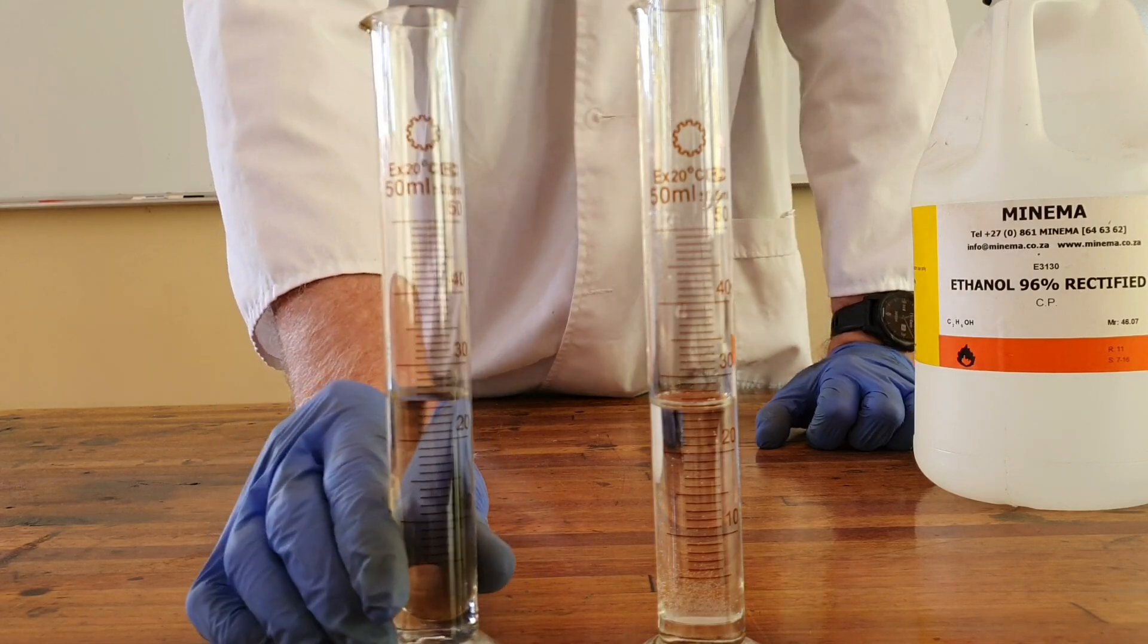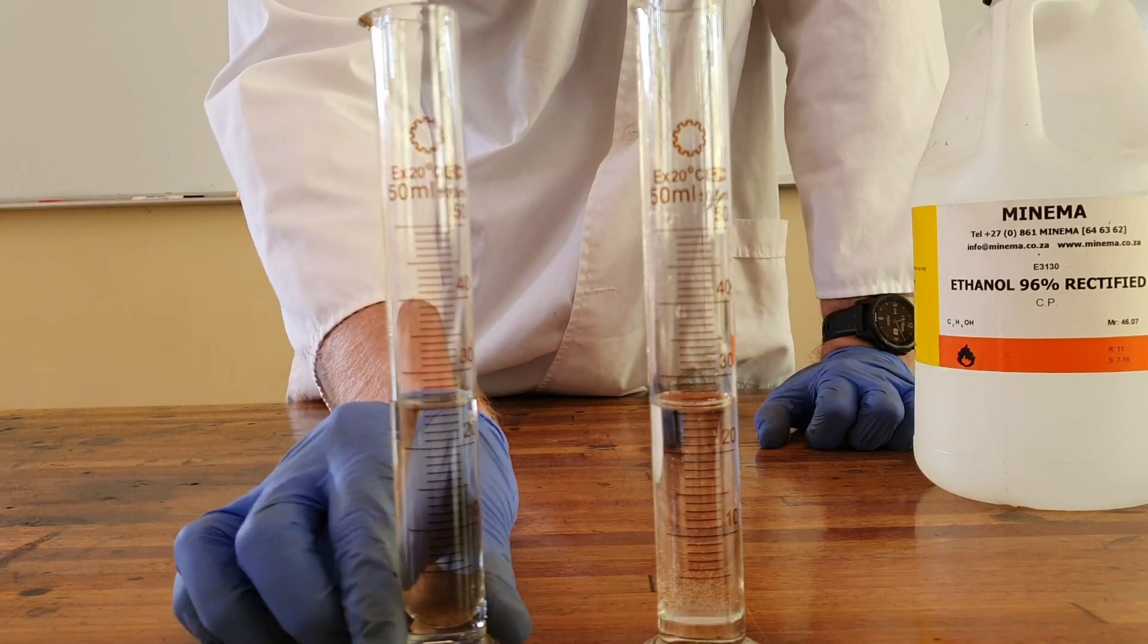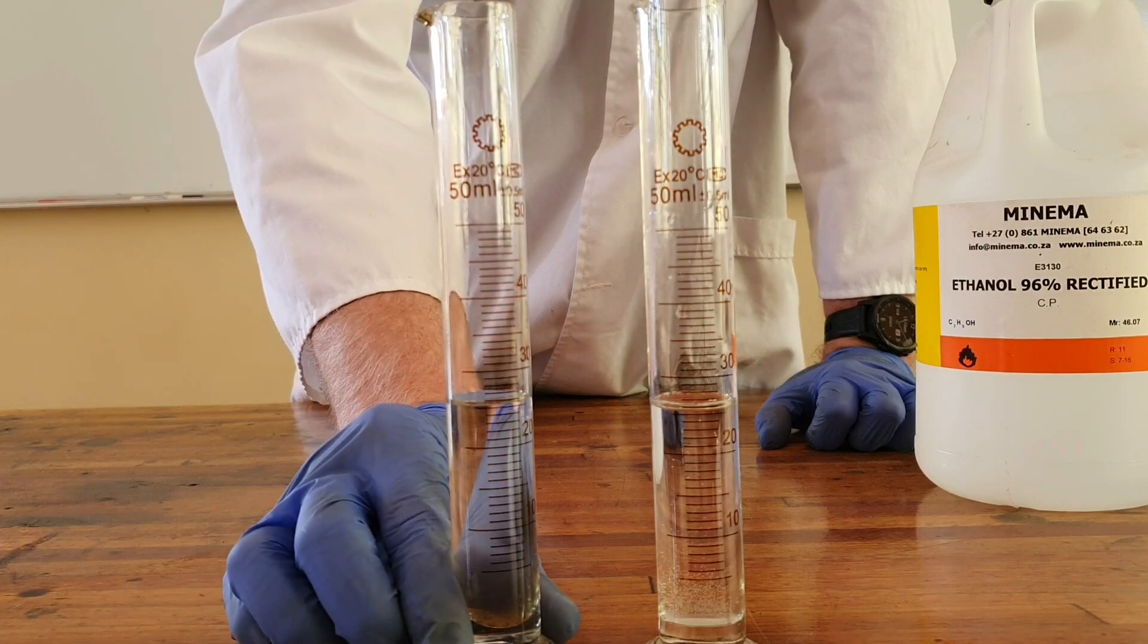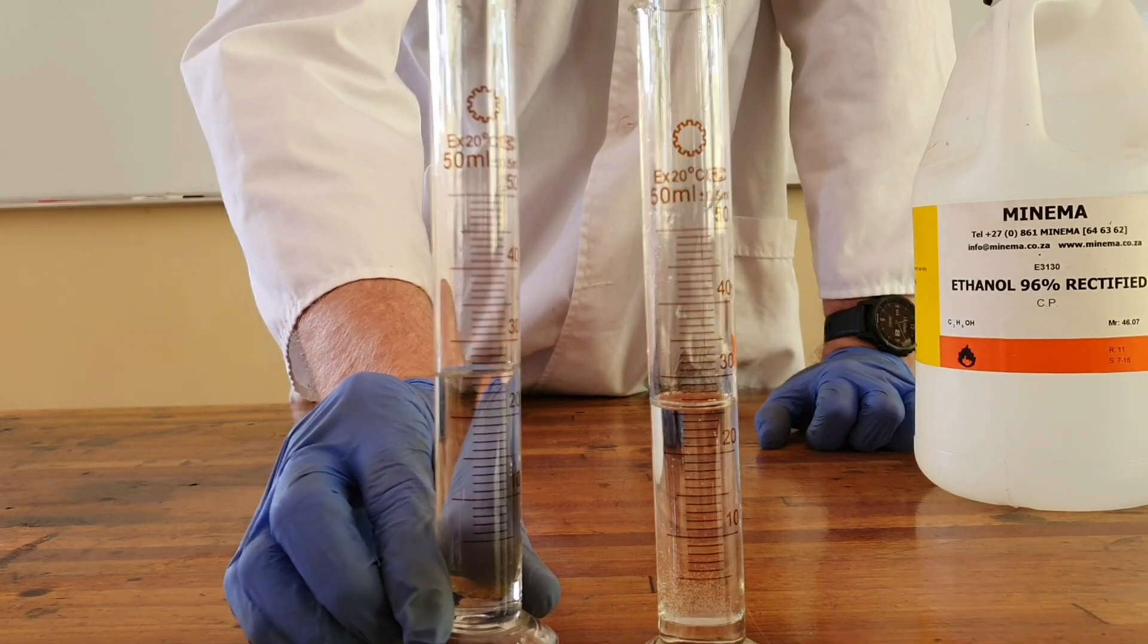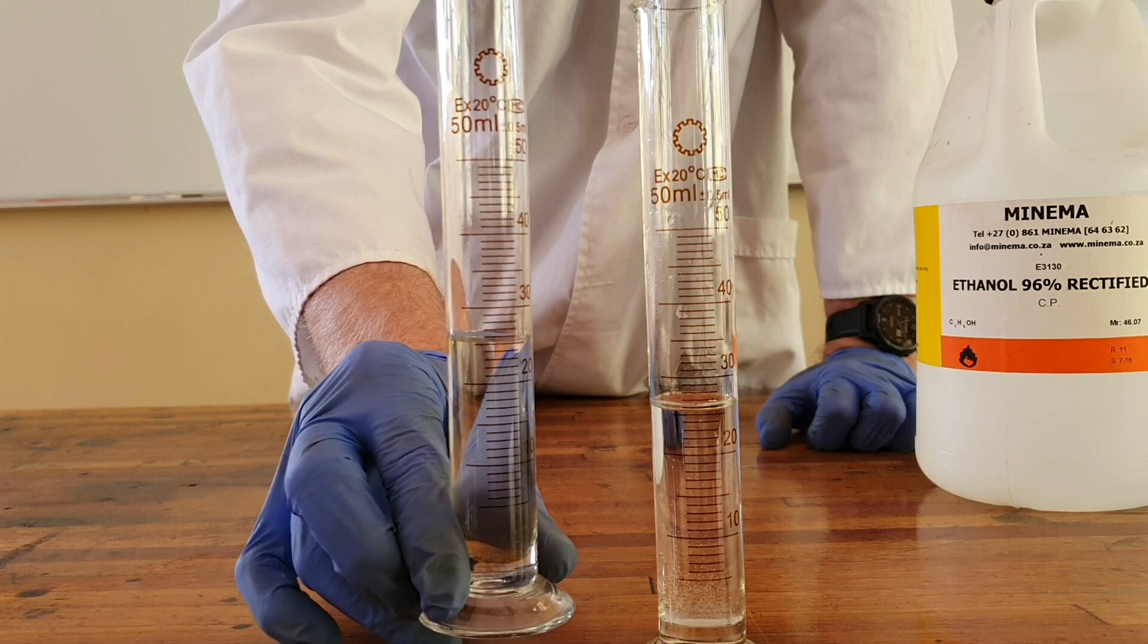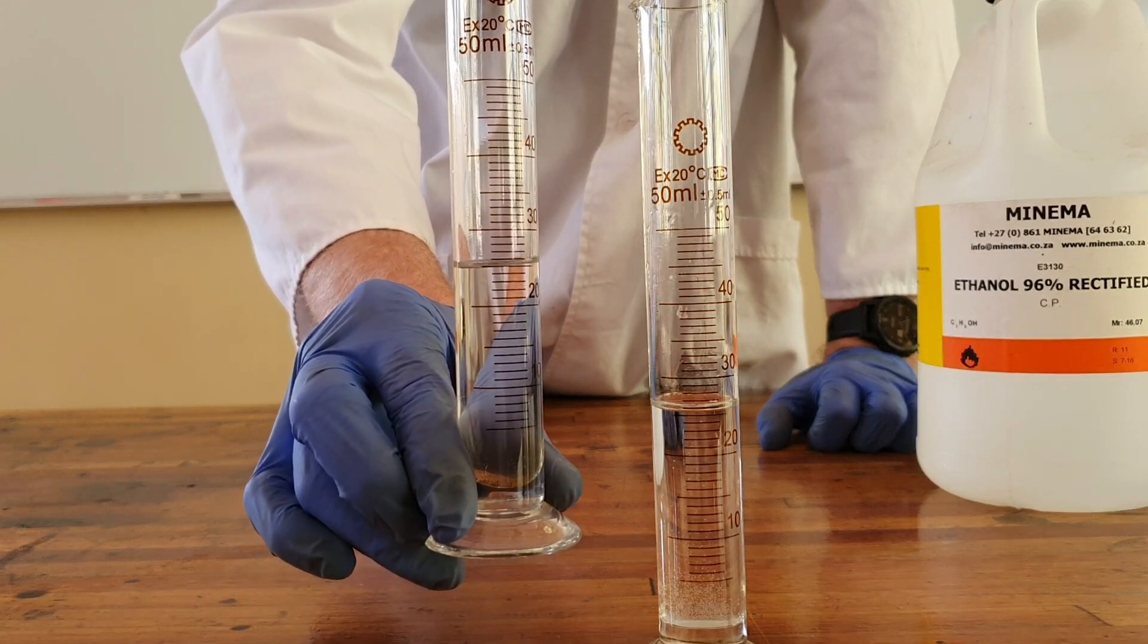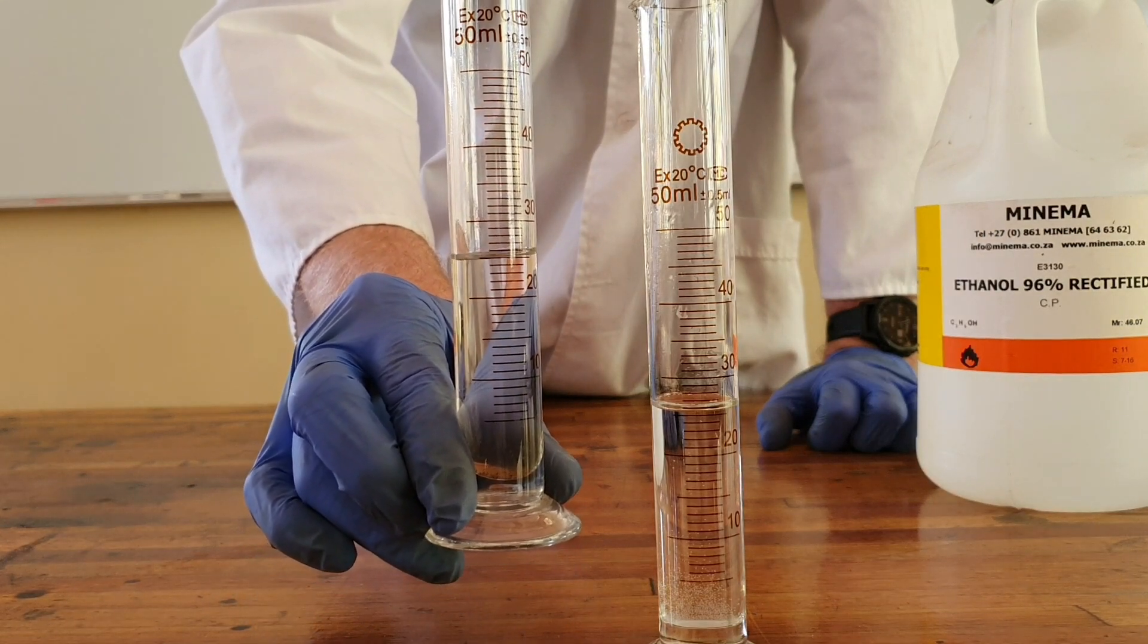In this hand I have ethanol, 25 milliliters. You can see that there is a meniscus that forms, that shape at the top of the liquid. And it is important to measure from the bottom of the meniscus.